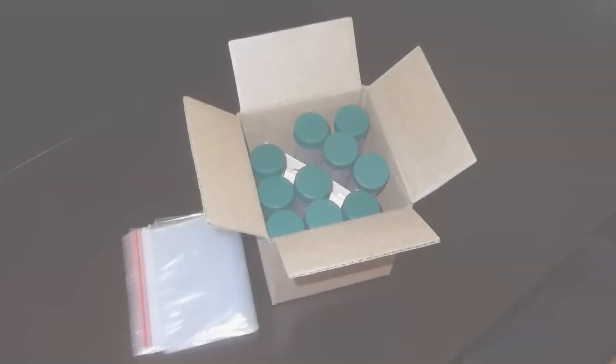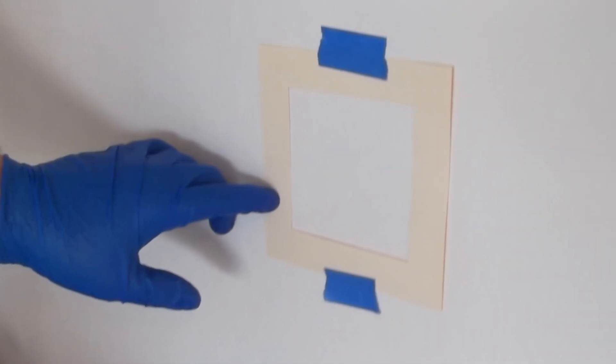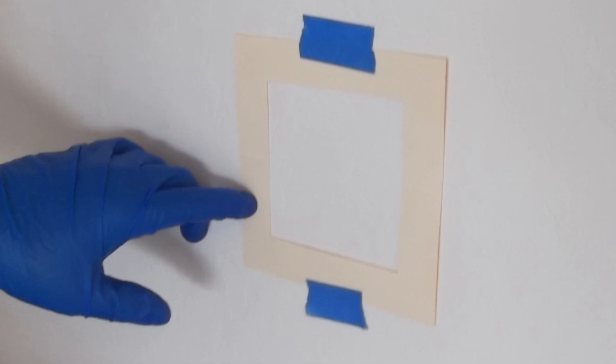To test for methamphetamine and clandestine drug residues, place a 10-centimeter by 10-centimeter template on the surface to be sampled and secure the template.